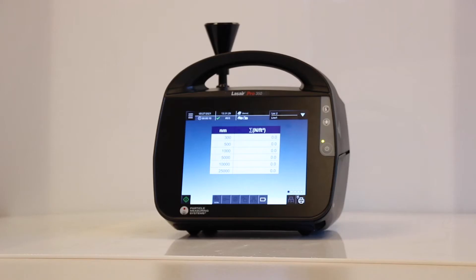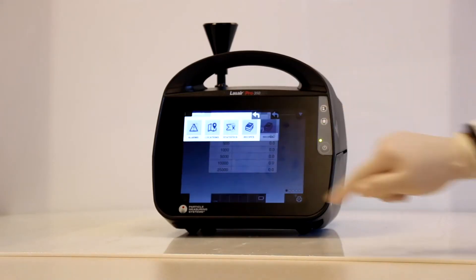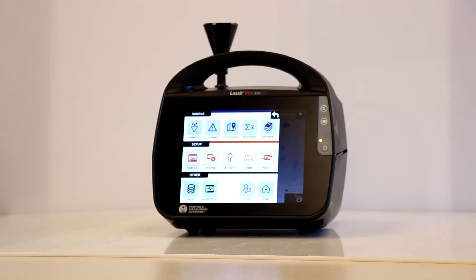This video will discuss the basic setup for a LaserPro portable aerosol particle counter. Navigate to the menu screen and then select the system icon.